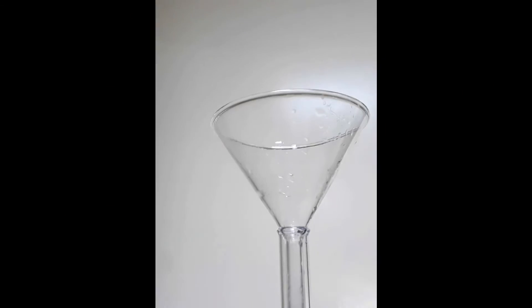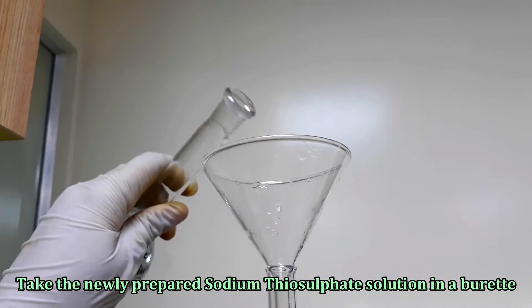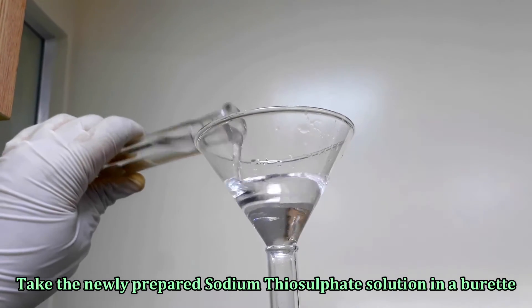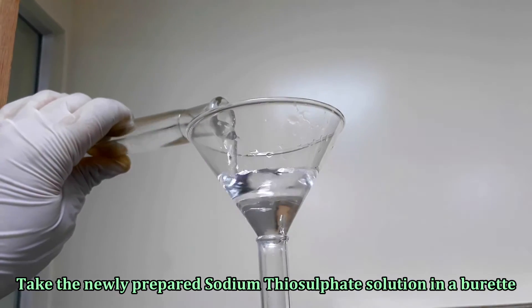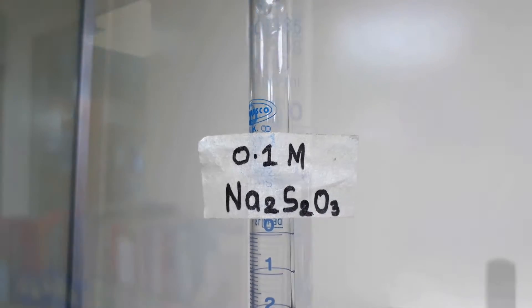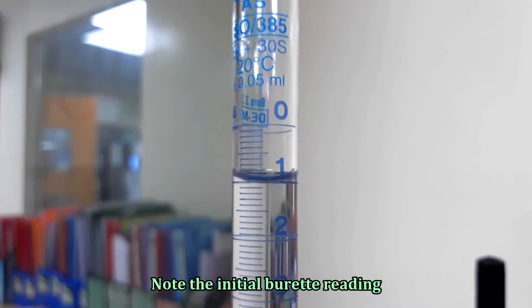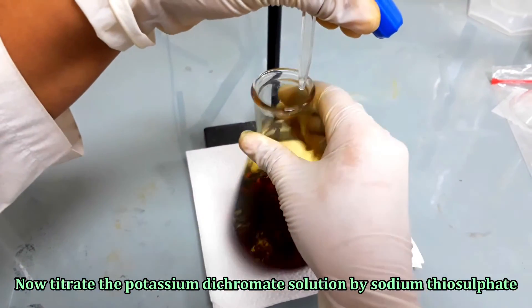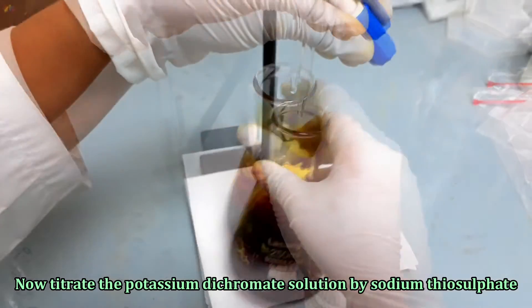For the standardization, take a newly prepared sodium thiosulfate solution in a burette. Note the initial burette reading. Now, titrate the potassium dichromate solution by liberating sodium thiosulfate solution from the burette.